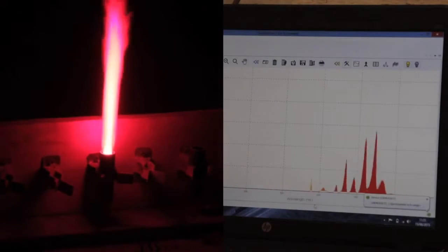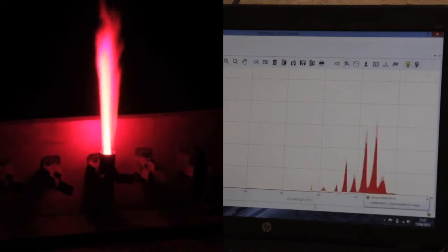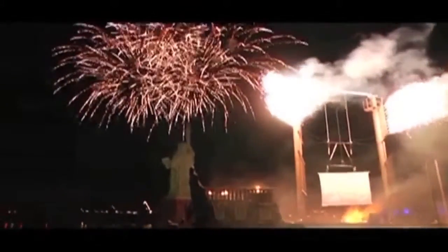The human eye can be fooled. So we're looking for colour purity, so we're looking for particular bands. An example would be a red product. We would be looking for emission from strontium radicals, strontium chloride radicals, strontium hydroxide radicals, and we can clearly see those in our spectra. But then we may also see some other things that we wouldn't be looking for. There may be a large sodium peak from a contamination.